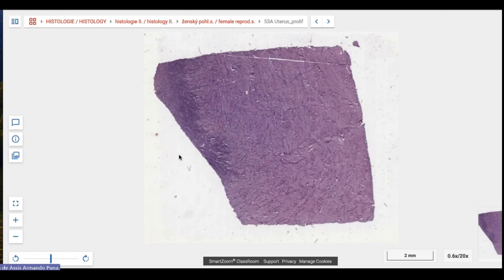But that endometrial part is very, very important, right? Because when the egg is implanted, the endometrium has glands, and these glands are going to be secreting all the nutrients that are needed for the egg. They're going to be creating the perfect environment for the egg. So when this endometrium part dies with the egg, when there's no fertilization, the uterus doesn't just stay like that, okay? The endometrial part is rebuilt again. It's remade. And this is where your 2 slides differ.